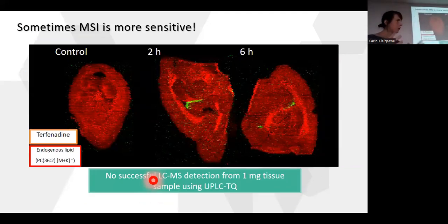Because in MSI we've got all of our analytes in the exact same spectrum, it's generally said that MSI is very insensitive, but that's not necessarily true. If you've got cases like here, where you've got only very small areas where the drug is localized, and you imagine taking the tissue and homogenizing it, it's like a ratio of 1 to 100 or so of having drug versus having no drug. This dilutes it possibly so much that you cannot see it anymore, even with LC-MS. But because we've got all of that little drug in one single spot, we can actually see it with mass spec.